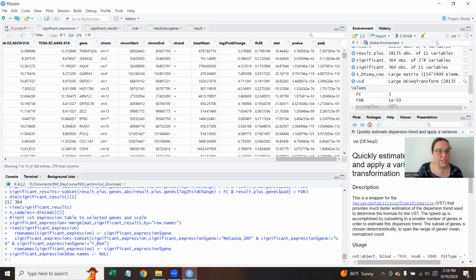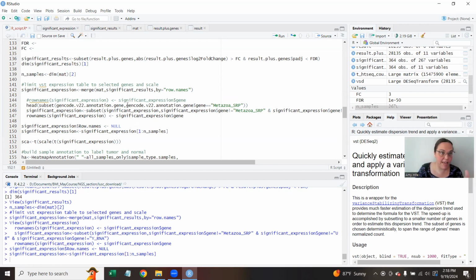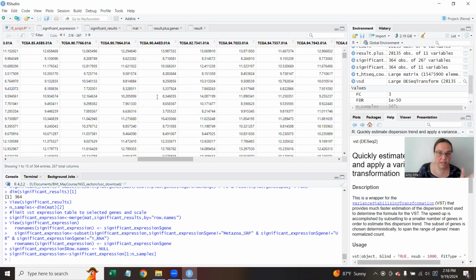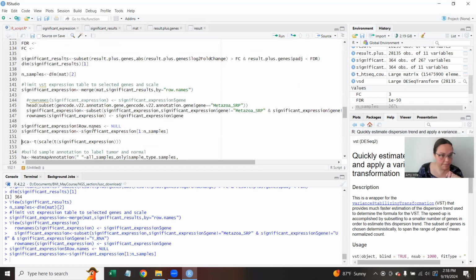So when we do this subset of our table, we're selecting only the first few columns that we know have normalized expression values in them. So we limit that. We can look back over here, and all of that is gone now. So we know that our entire table is only normalized expression.